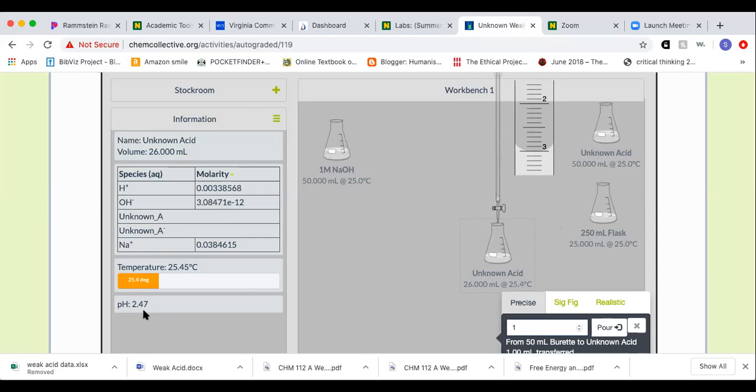And so what I would do is, on a sheet of paper or an Excel sheet, record down your pHs with each subsequent volume aliquot that you put in there. So here is now 2 milliliters. Every subsequent one is just going to be an additional 1 milliliter. So I'm at 2 milliliters now, and then again at 3, and you'll collect another pH, and at 4.